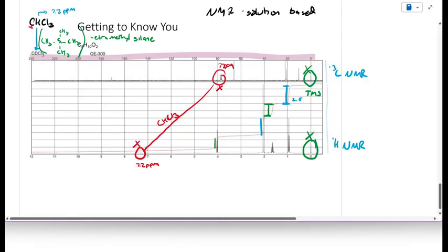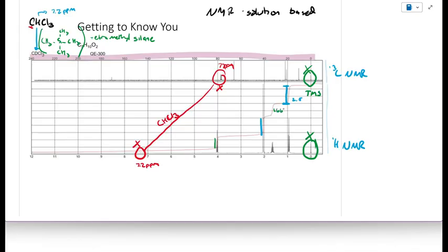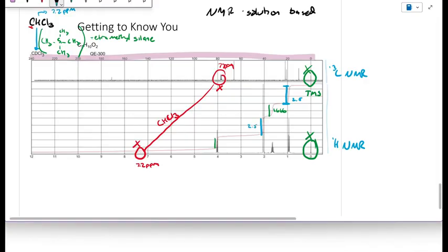It's a little bit more than 1.5 blocks. It's more like 1 2/3 blocks. So the blue integration appears to be 2.5, and the green integration appears to be 1.6. So that means that this one should also be 2.5, and this one should also be 1.6.